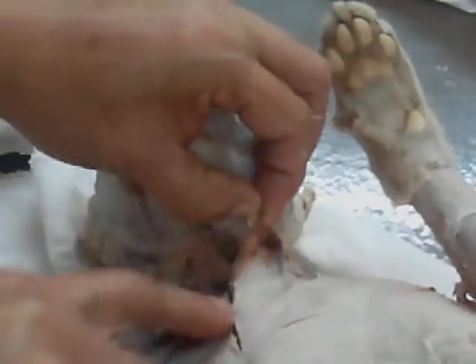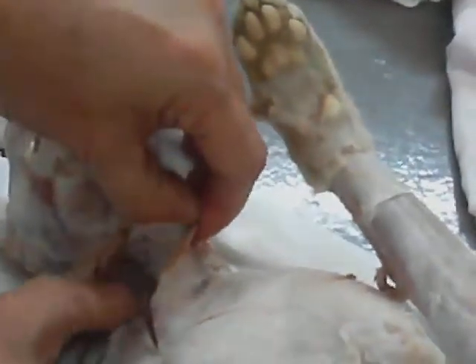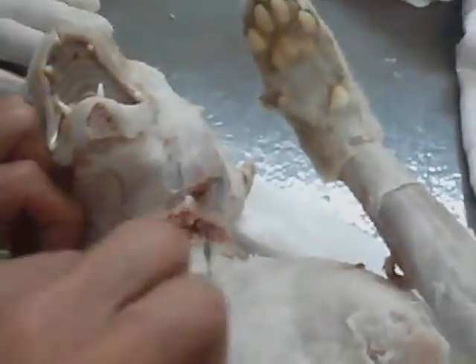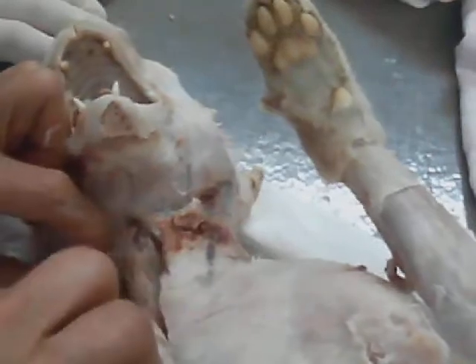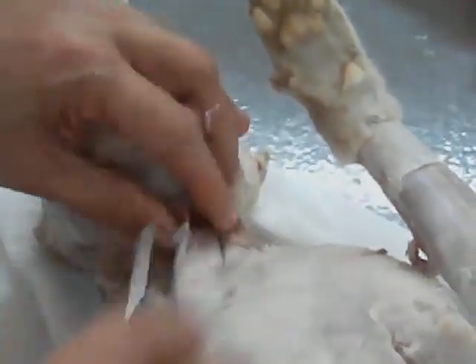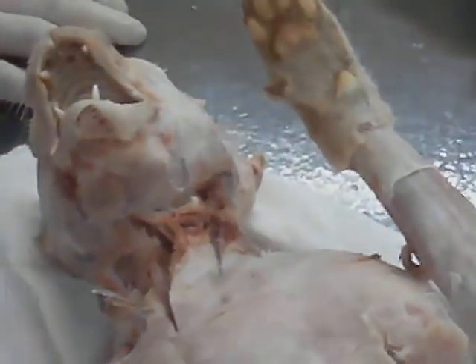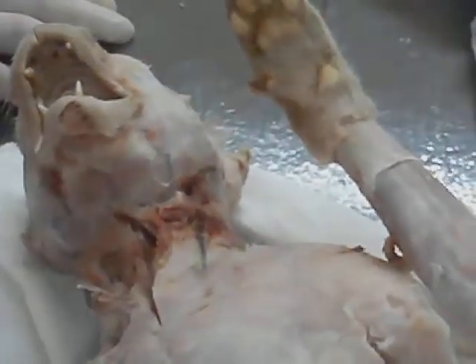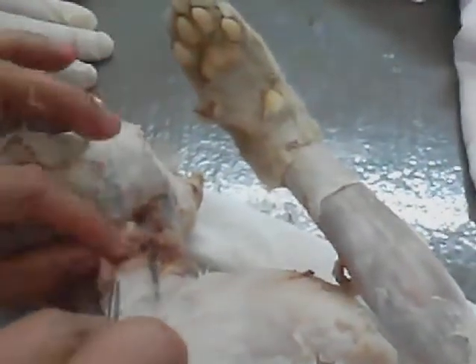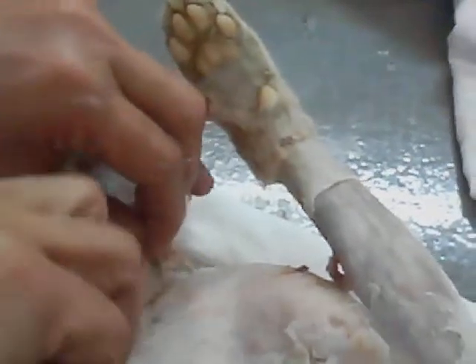Push, push. Pectoantibrochialis — the muscle where the external jugular vein runs, and you can see that. Pectoantibrochialis — when you shout, then something is coming out. The muscle to which it is running is now this, pectoantibrochialis.